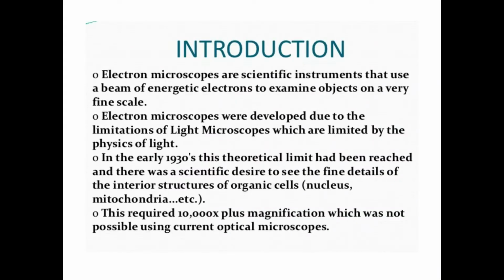Now let us start with a small introduction about the electron microscope. Nowadays electron microscopes are very popular, not only in research and development, but we also use them for educational purposes. In your school days and normal laboratory, we may have the word microscope, the optical microscope. These are scientific instruments. In the optical microscope, also called the light optical microscope, we use light rays to capture the microstructure and other related things from metallic and non-metallic objects.